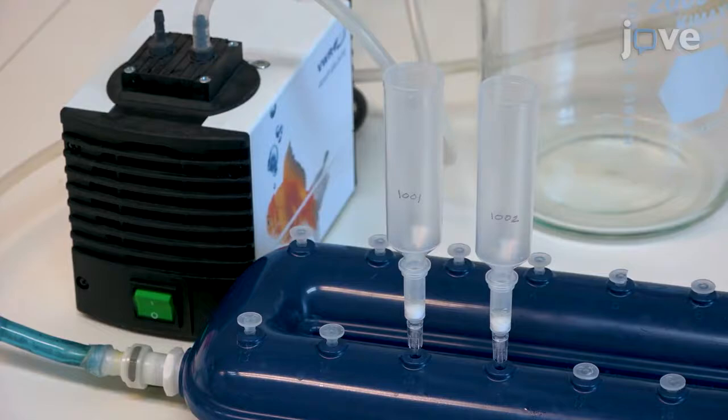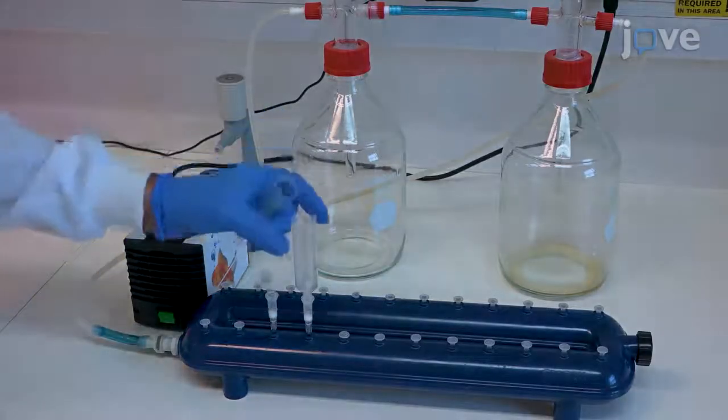switch off the vacuum pump, release the pressure to 0 millibars, and carefully discard the tube extender without contaminating the adjacent column.